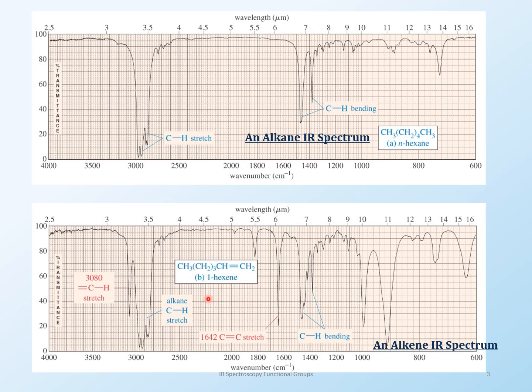Now you're also going to see the double bond carbon hydrogen peak, and that is coming on the left side of all of these. So remember, this is the CH stretch. Now you see the CH stretch also, and now you can see why I'm telling you to ignore this, because every time you're going to see the CH stretch, because all organic compounds have CHs in them, at least the ones that we are going to look at. So, keep that in mind.